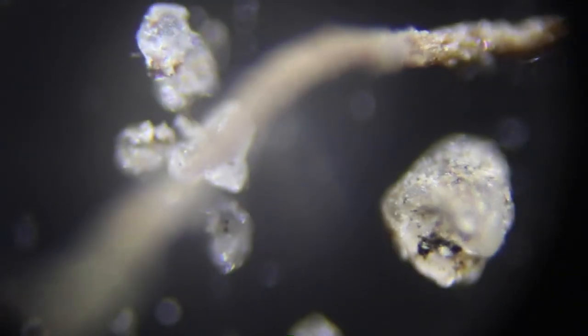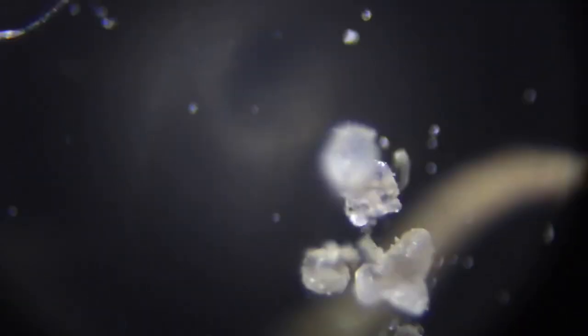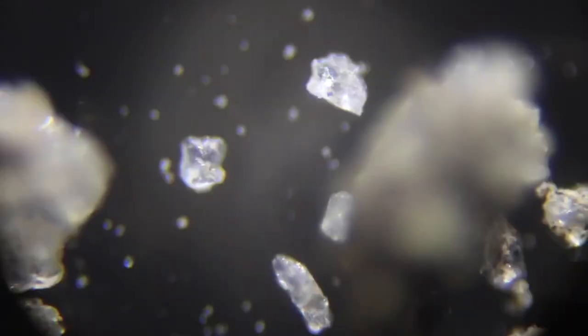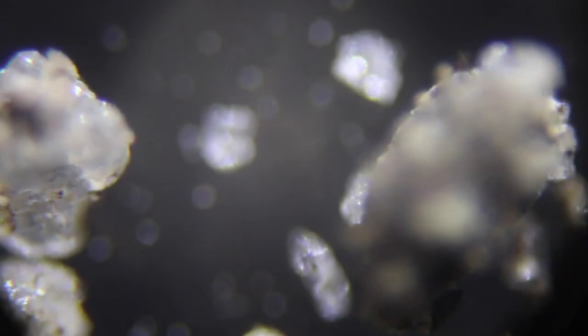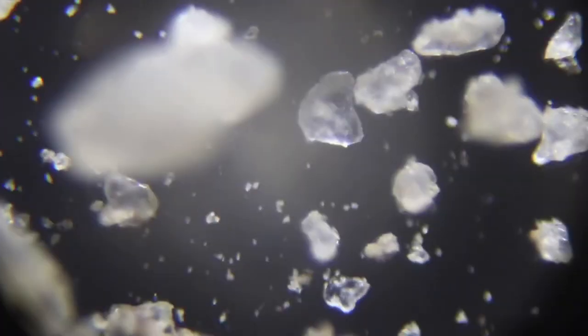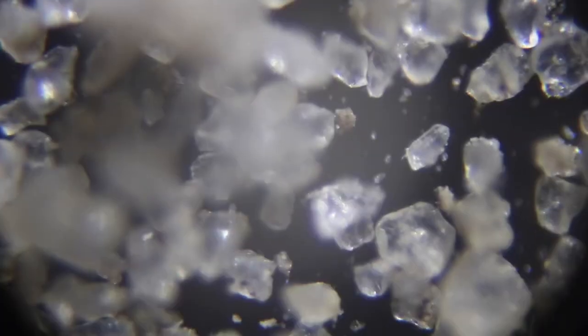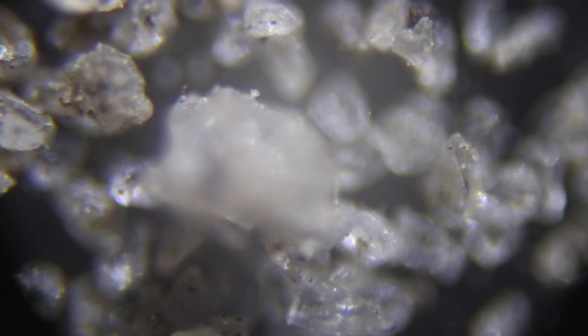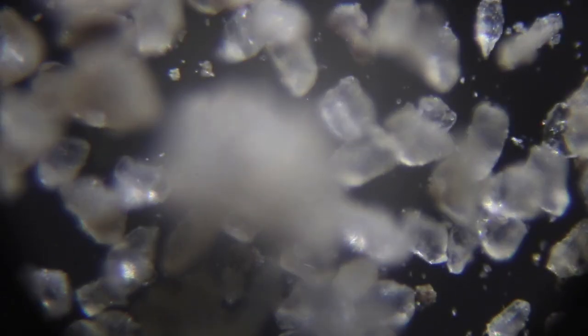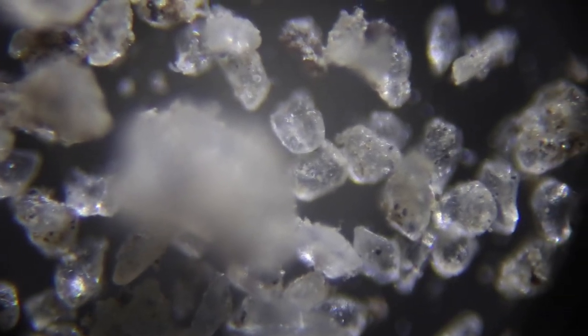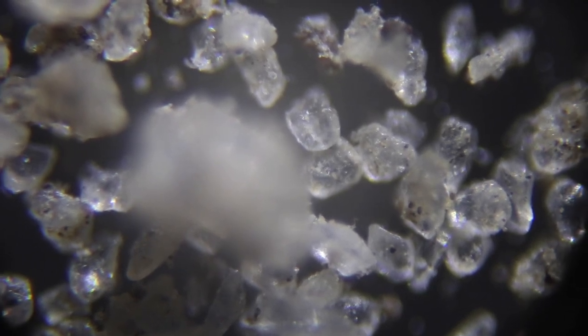This specimen is a piece of sand, or is it some sand that I collected from outside. Interesting. And I'm going to move around here, see if we can find a clump. Let's look at this one. How interesting is that. Let's see what else we can see here. It's just sand that we have from outside. If you're getting sand at some of the beaches, sometimes you can see tiny minute little shells, diatoms if you have a high enough magnification. And my daughter said rocks, sand is tiny little rocks, and that is true.